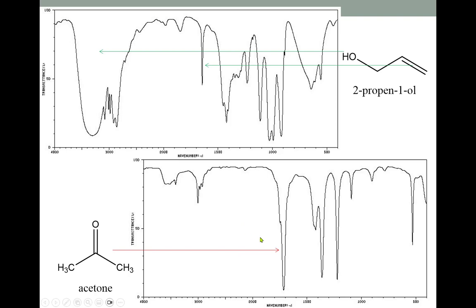These are real lab spectra, so they're not as clean maybe as something you'd see in a textbook. But when I look at my alkene alcohol, I can see those bonds. The CC double bond here is that sharp peak between 1600 and 1700. I can see the broad sweeping hydrogen bonded alcohol peak over here in that 3300 to 3500 range. If I look carefully, this little blip right there is probably the CH alkene bond, showing up just between 3000 and 3100. It's largely obscured by the wide hydrogen bonding peak from the alcohol, but I can see it sticking out there.